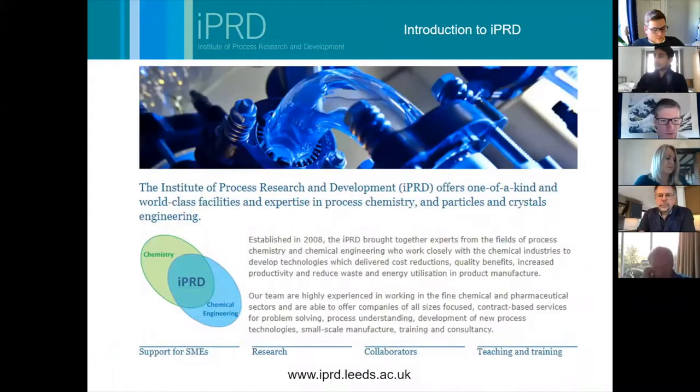So John mentioned IPRD. IPRD is our Institute of Process Research and Development. And it's within IPRD that we've done many of the developments of the fReactor. This was never a big funded project externally. It was something that we started. And the students within IPRD, a mixture of engineers, chemists and biology students, and the academics have all got involved in this project.